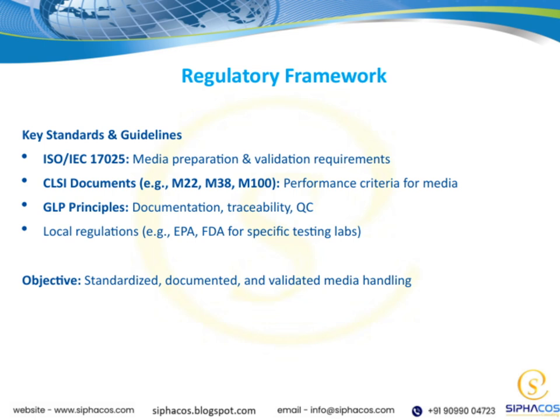These documents help us verify that our media meet the necessary standards for accurate and reproducible results. We also need to adhere to Good Laboratory Practice Principles, or GLP, which emphasize proper documentation, traceability, and quality control throughout our processes. This ensures that every step is recorded and can be reviewed if needed. In addition to these international standards, local regulations like those from the EPA or FDA come into play, especially for specific testing laboratories. These regulations may have additional requirements to ensure compliance within particular regions or industries.